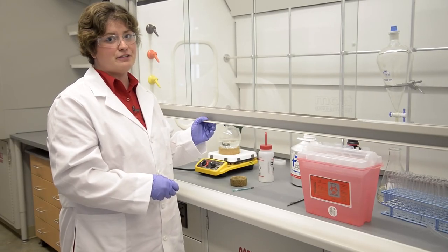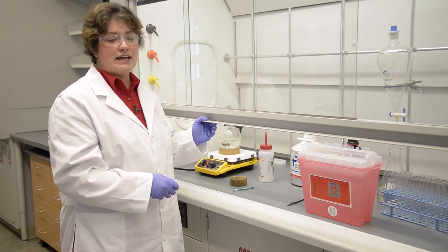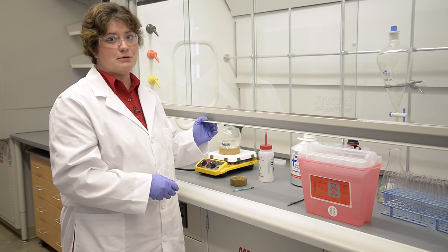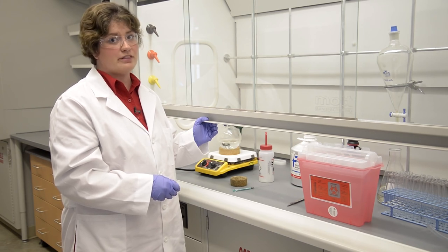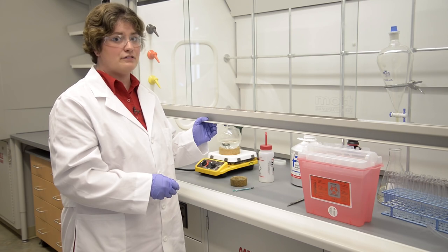Also, never put your head in the fume hood to look at a product. Large pieces of equipment and lots of chemicals can block airflow, which means you're not being properly protected against what you're working with, so avoid putting lots of chemicals and large pieces of equipment in the fume hood.